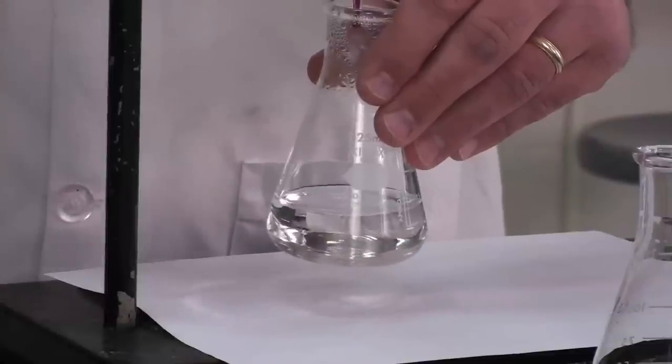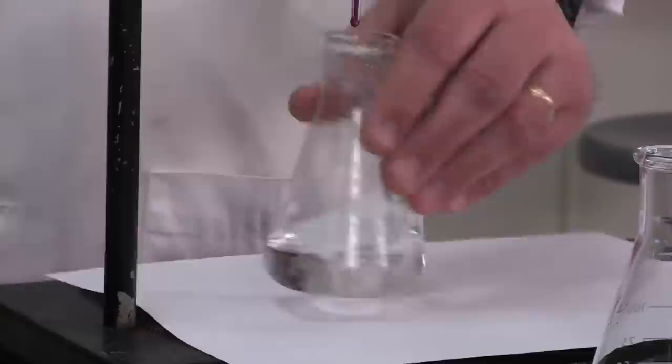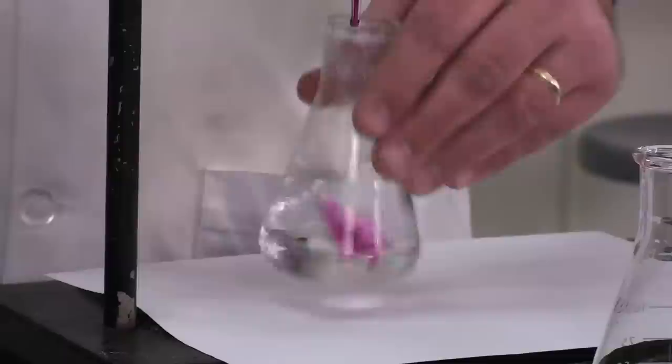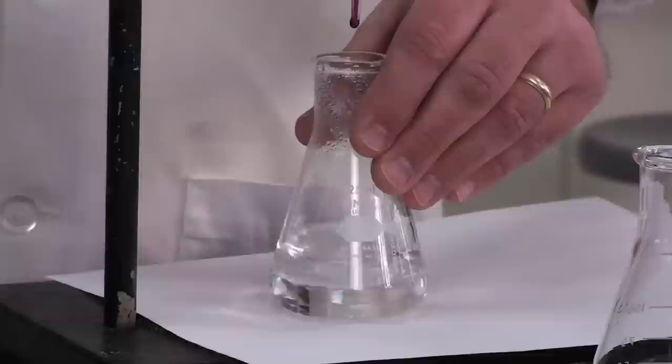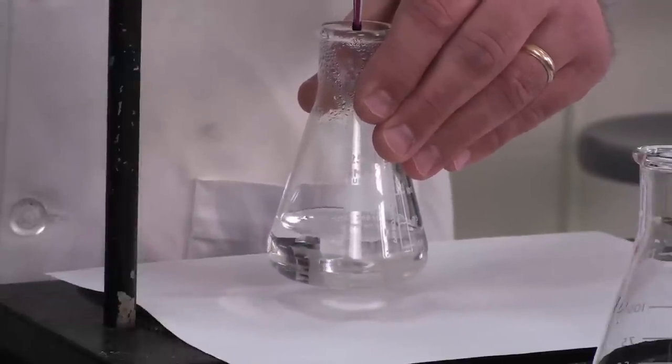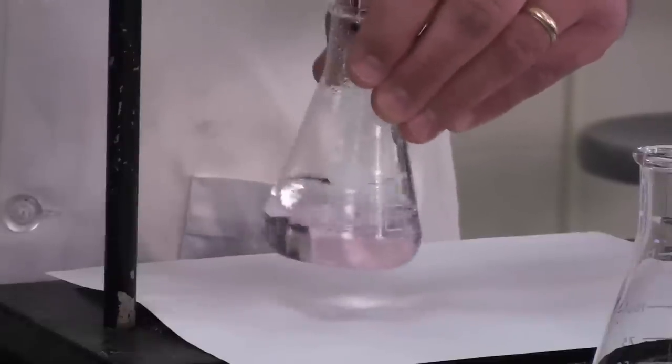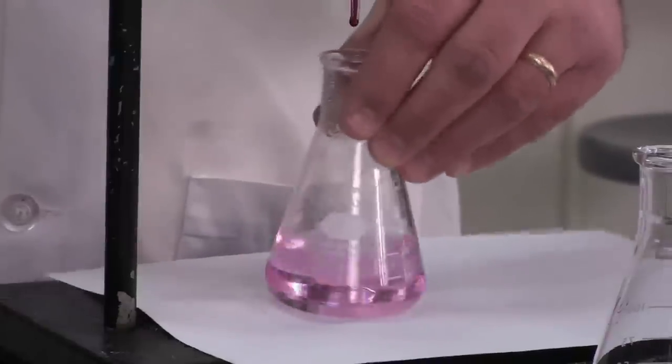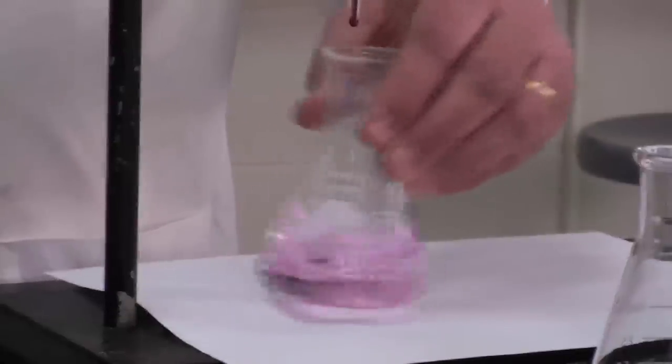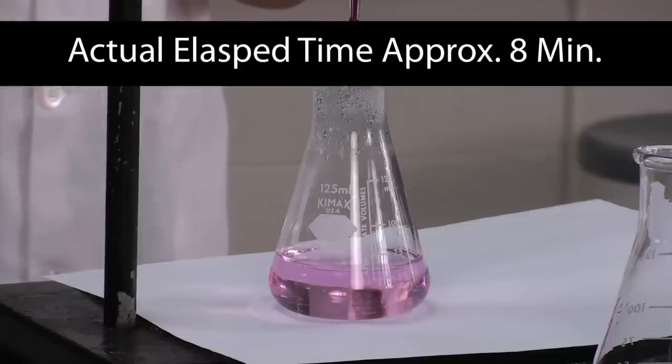We're looking for a persistent pink-purple color where we define persistent as lasting longer than about 30 seconds. And that should happen with a single drop, so we just have to patiently look for that drop. And there it is—there is our persistent pink color. So we have reached the endpoint of our titration.